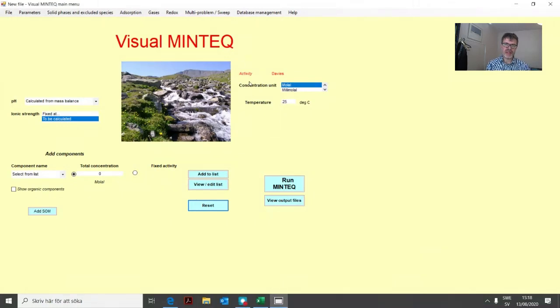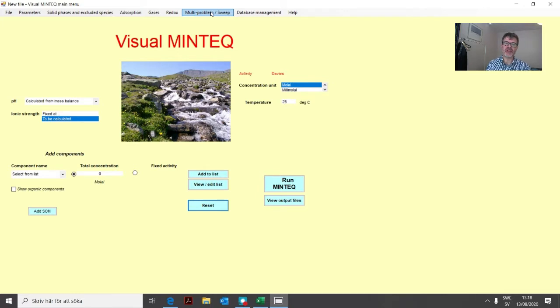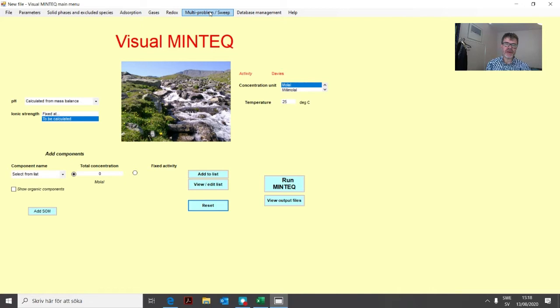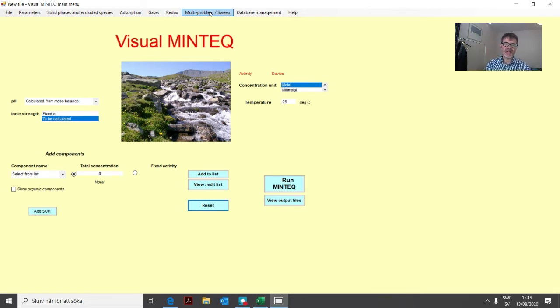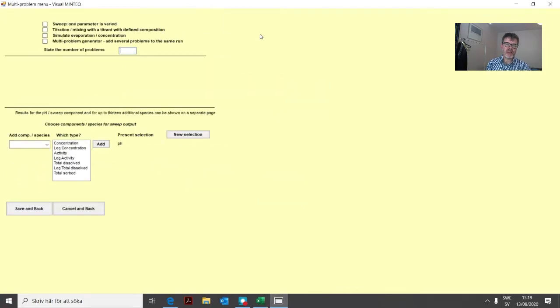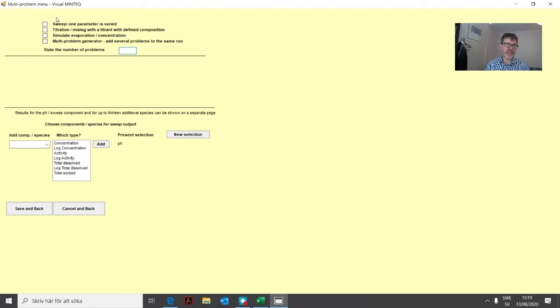In this lesson we will be focusing on this option in the menu section, multi-problem sweep, and the different options that we have there.